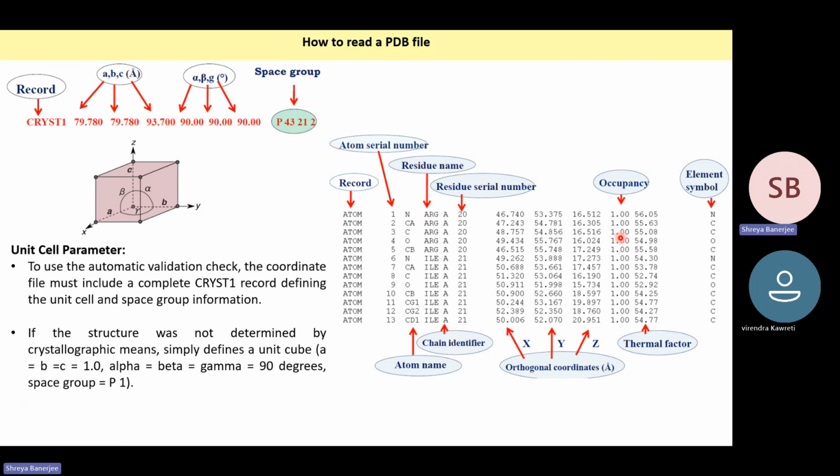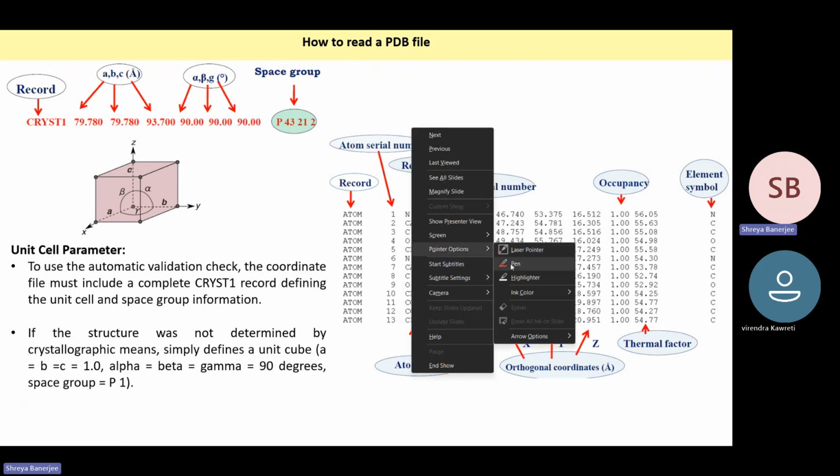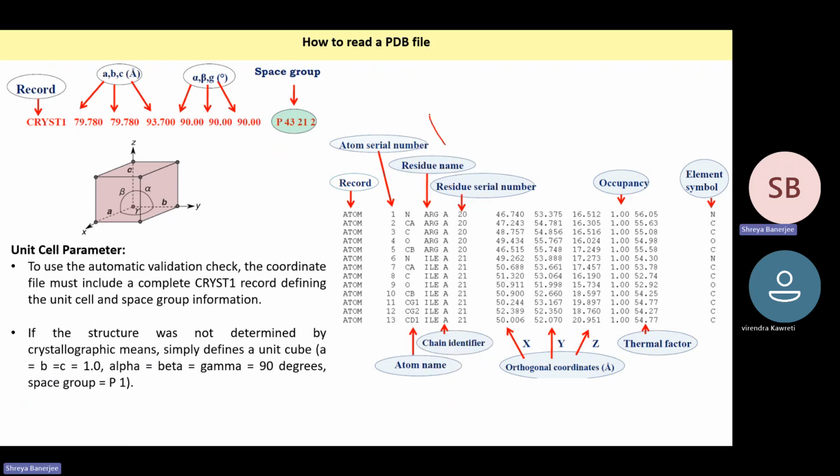Then there is the occupancy. Occupancy means that suppose you have a phenylalanine and the side chain phenyl is occupying 2 different regions. So for some time it is staying in one, so let us imagine a phenylalanine. Just ignore this.